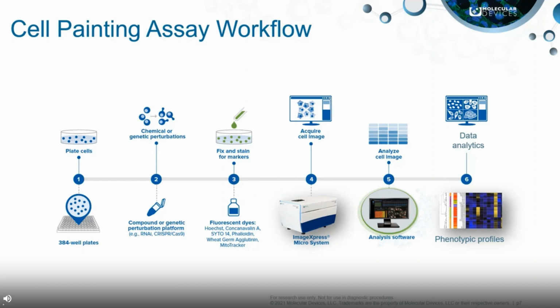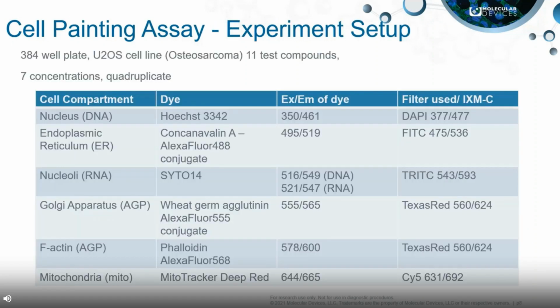And so here, what I want to do today is to present a complete workflow where one can independently complete a cell painting assay from start to finish. We set up a simple cell painting assay to demonstrate how you can carry out the workflow from start to finish.